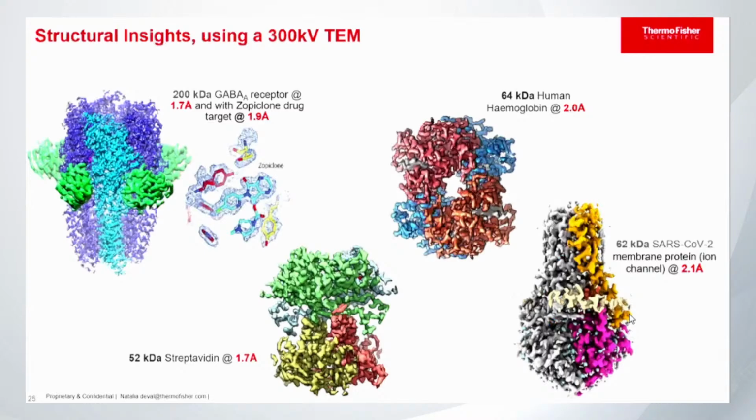Some samples, biologically speaking, will have a limitation in resolution, and it's not because of the hardware, it's because of the biology of the sample. That's the reality. So for example, the GABA receptor, you remember we are around 3 at 100 kV, around 1 point something with the 200, and we have 1.7 at the 300 kV. And you can already start seeing small molecules, like drugs, that can bind in different areas of the GABA receptor. You can really visualize the density of those small molecules.